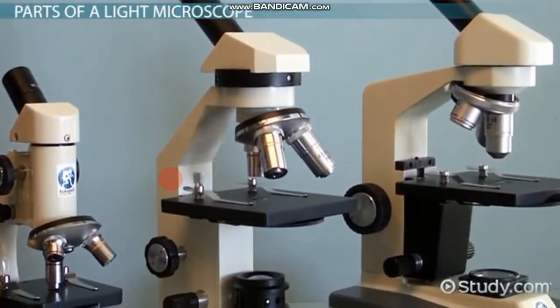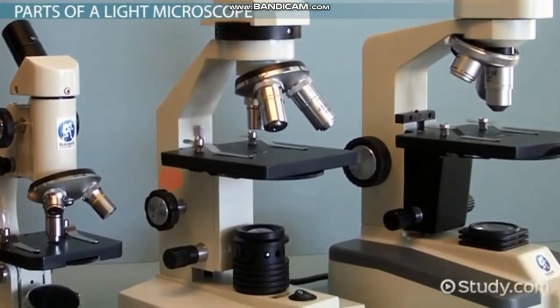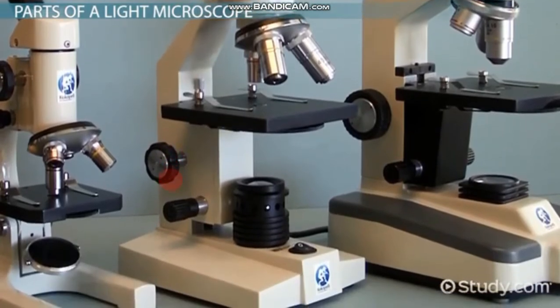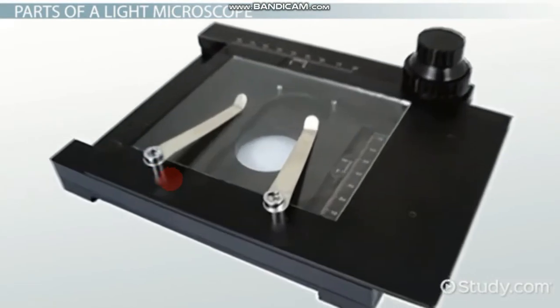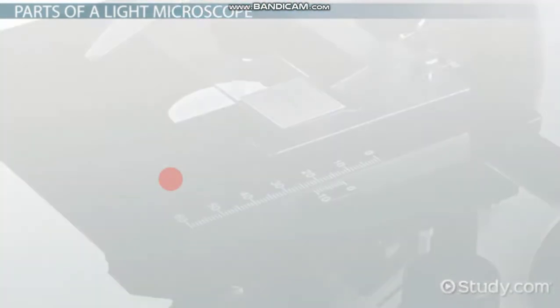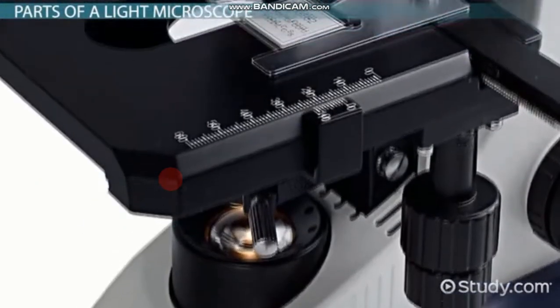Even though microscopes can look very different, they all use the same principles to magnify an object and have the same basic parts. The stage is the platform that holds the sample, usually a slide held in place with clips. This part of the microscope can move up and down to adjust focus.